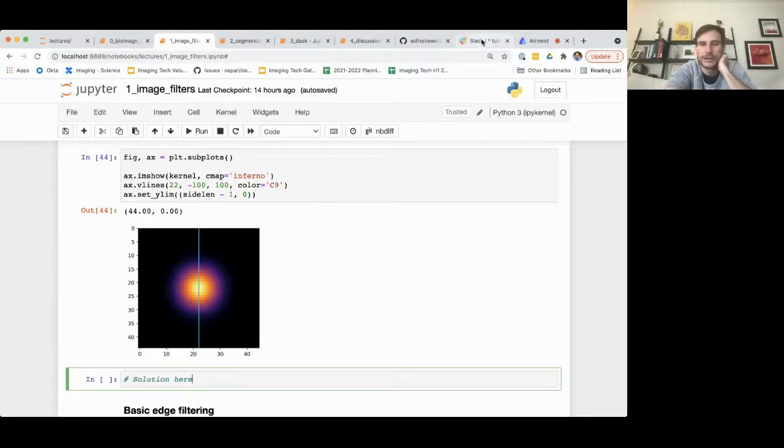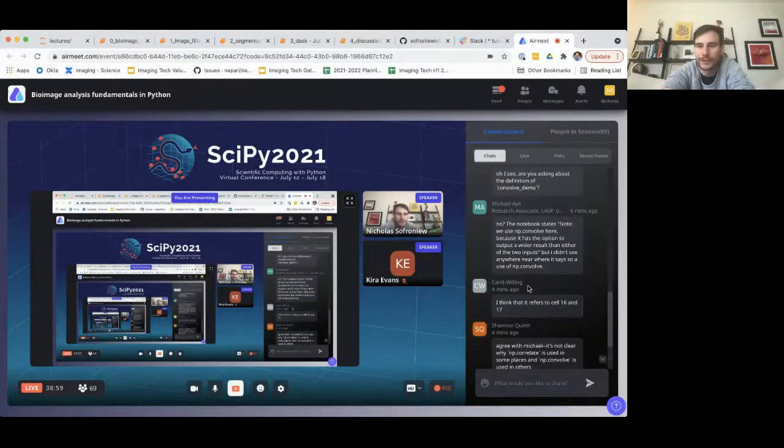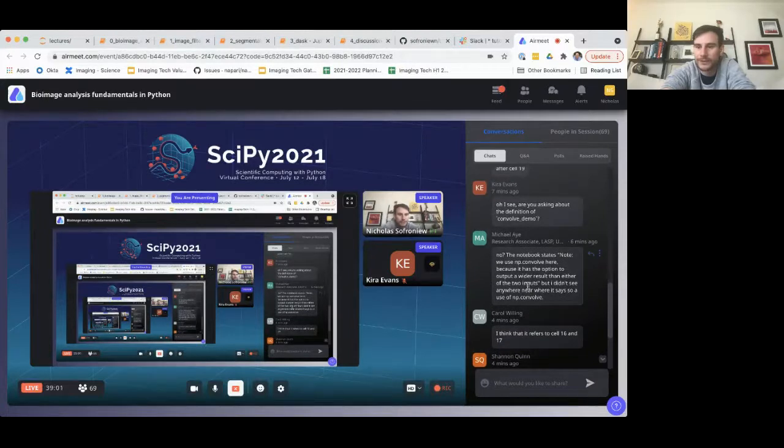I'm going to check the chat again to see how things are going. There's a question about why np.correlate is used in some places and np.convolve is used in others. I think it's really to demonstrate, at this level, the interchangeability of them up to a sign difference. People use both terms, and there are different conventions associated with both of them.